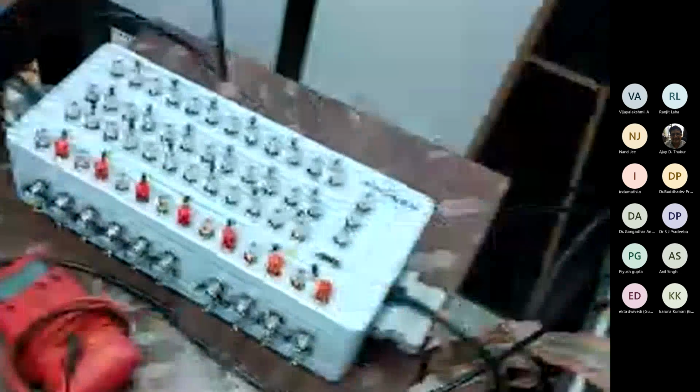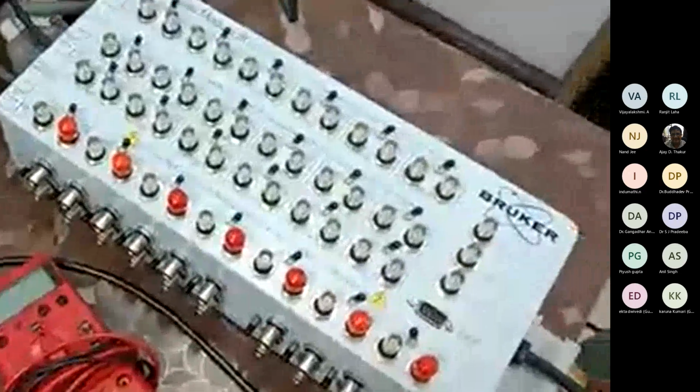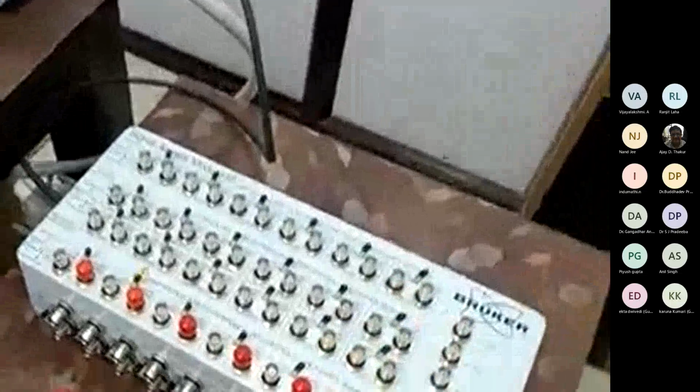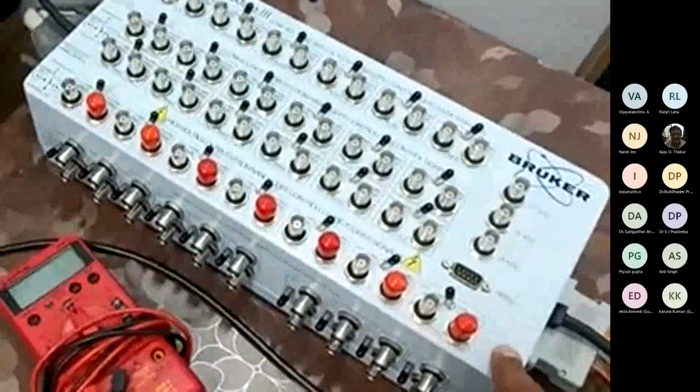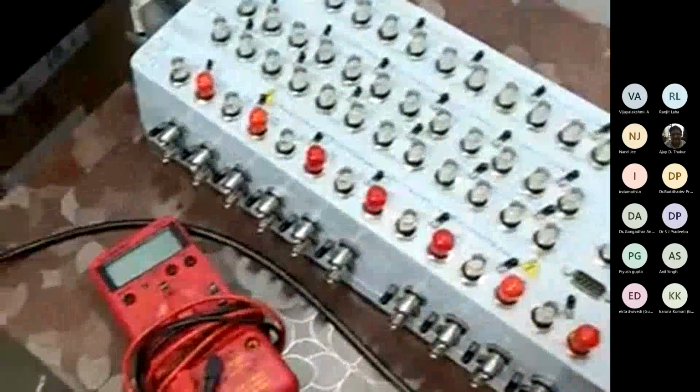And apart from these things, we have an extra module also. This is the electronics. Basically, this is the signal access module. We can access all the signals coming from the hardware to the controller, and we can feed external signals here. Maybe we can put a wave function generator here, maybe an extra lock-in, and according to our requirement, we will customize this machine.